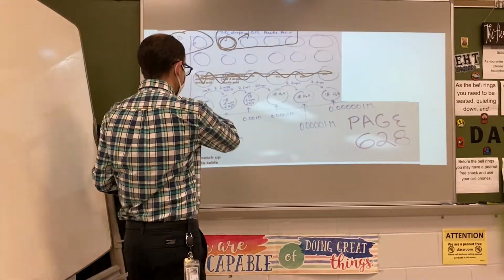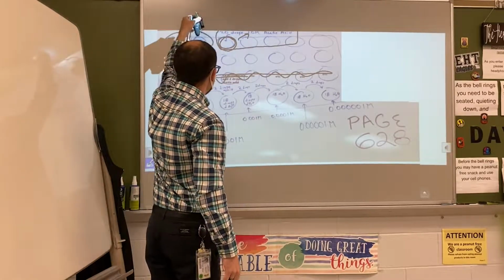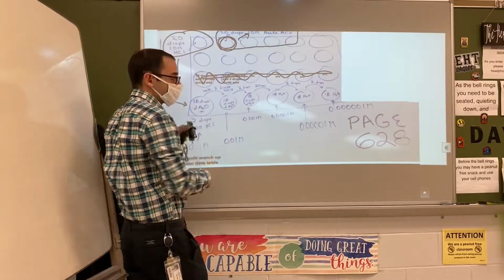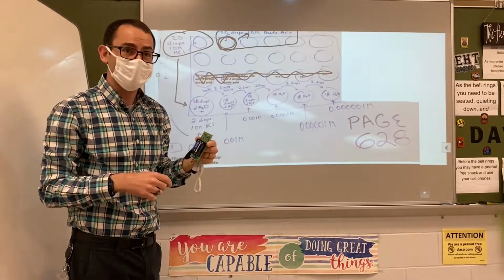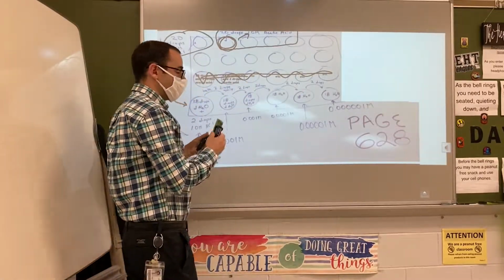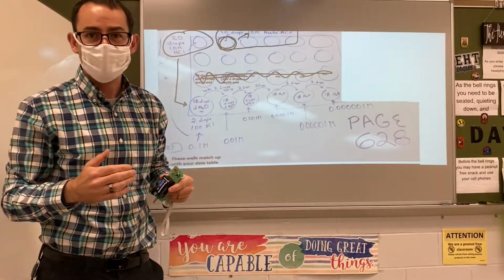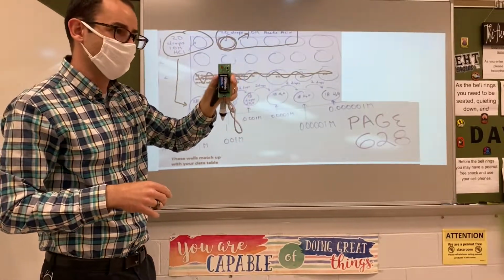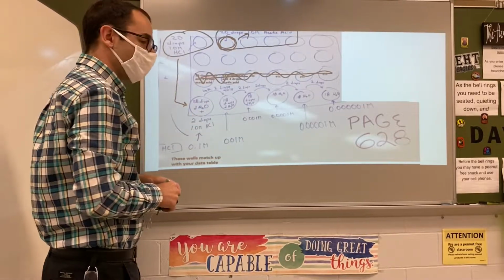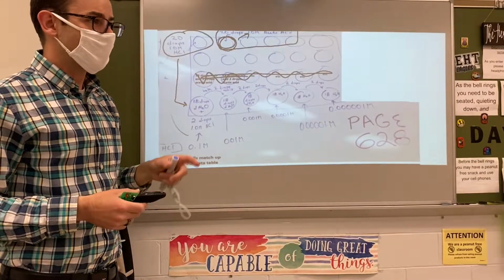And then that's it. Once you have this all set up, then you're going to put your conductivity meter into each of these, rinse it off in between each sample, just with the squirt bottle with a little distilled water, all right? Go in there, test it out. When you're done with it completely, after you've used this completely, then put a drop or 2 of universal indicator into each of them, all right? Because we don't want to put this into universal. We'll do that at the very, very end. All right, and that'll give us our data, and then we're basically going to talk about what our data means. Any questions with that?